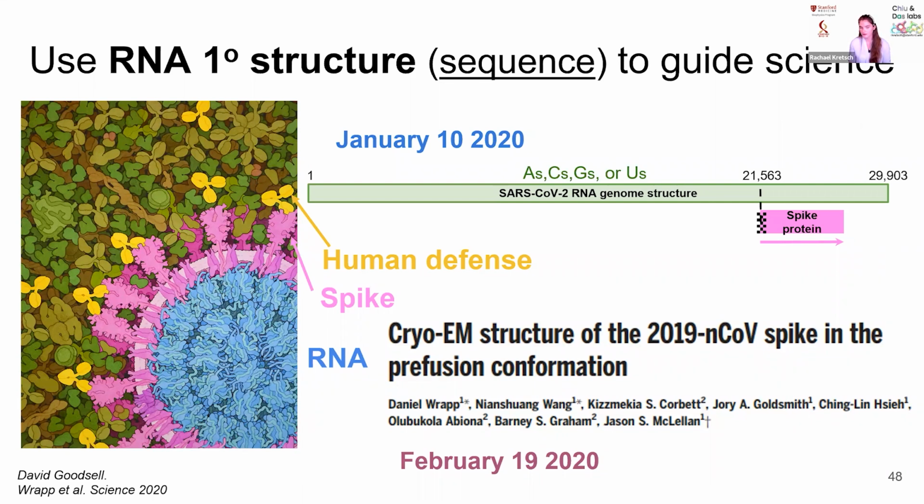That is incredibly fast, and we were very impressed. Now, one thing to note is this is a protein. The field is much more advanced for proteins. I work on RNA. We're not quite able to solve these structures within a month yet, but the fact they were able to do this for a protein gives us hope that maybe years down the line, we'll be able to do this with RNA as well. So I said Cryo-EM was an important factor here. Let's go through what Cryo-EM is.